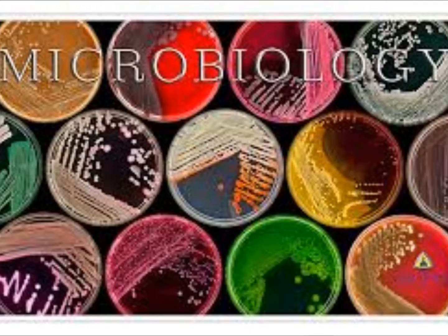Because hemolysis, especially when you say the greening, and maybe a 48-hour on gamma that gets dark looking. Gamma, it even confused the students. Gram-negative organisms after 48 hours, the colony actually just gets darker on the media, and it does kind of get confusing, because what is a green? It's kind of a dark too, but you wanna make sure that it's the halo.